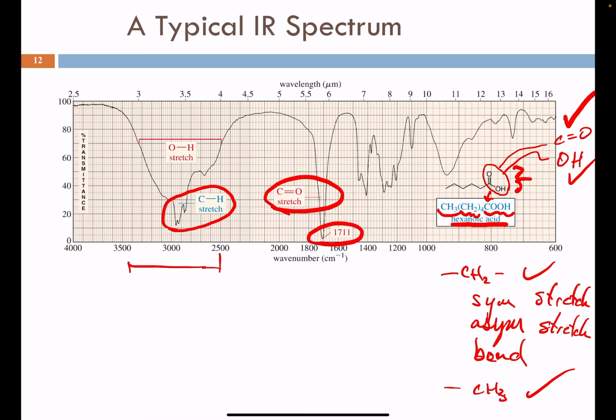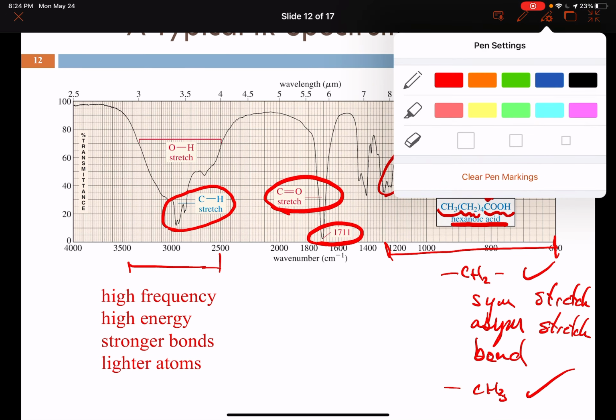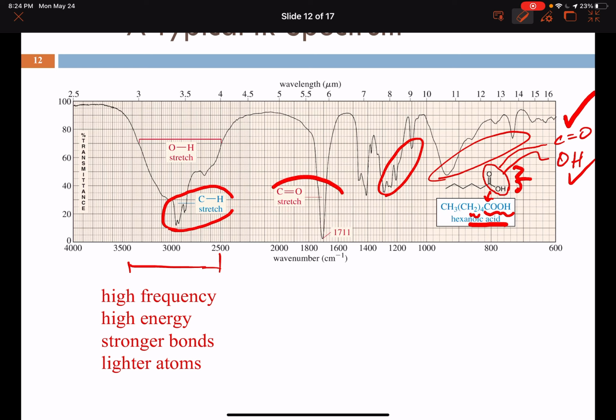So this IR spectrum has identified all the bonds present in the molecule, aside from carbon-carbon single bonds, which we would expect to find in the fingerprint region. So notice in this spectrum, those haven't been highlighted, but clearly some of the specific ones here and here are going to be unique to hexanoic acid and act as a fingerprinting bit of information. Okay, so with that, let's just clean up the slide so we can read some of the content that's speaking to many of the same points.